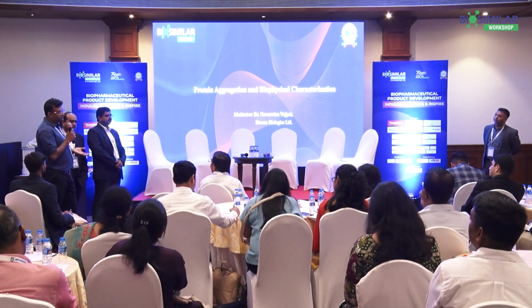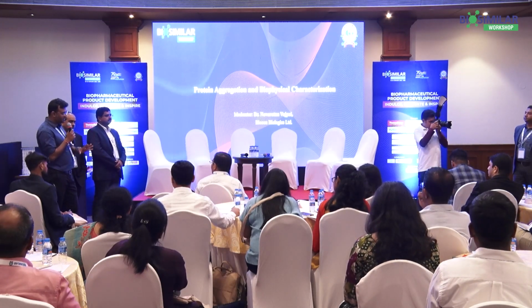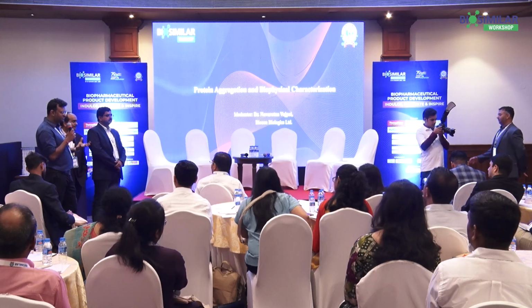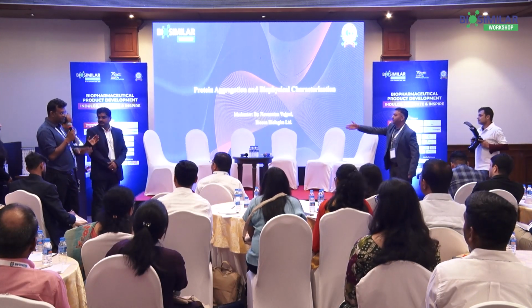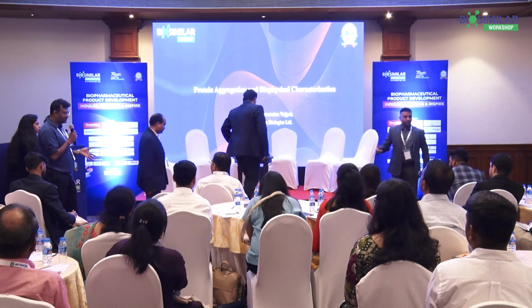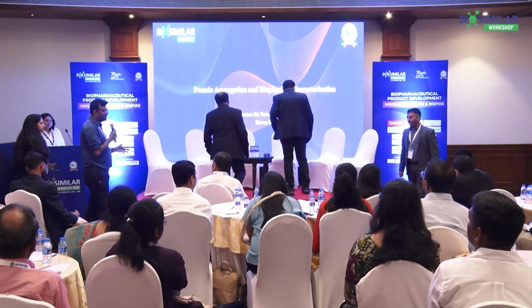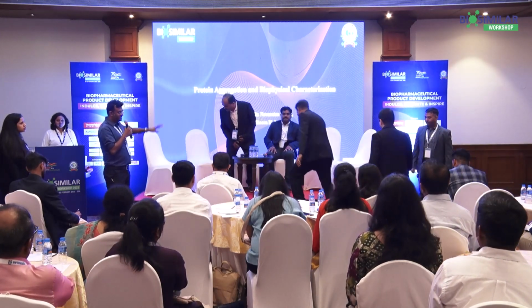Well, if you are talking specifically about monoclonal antibody high concentration formulations, most of the antibodies available as of now do not have that kind of a viscosity issue. They are all easily miscible in water and they are aqueous in nature. So not as such, but yes, nevertheless, as I said, these are not the only tests. There are so many other things that you can do. We didn't speak about density assessment, and we didn't speak about extinction coefficient determination.